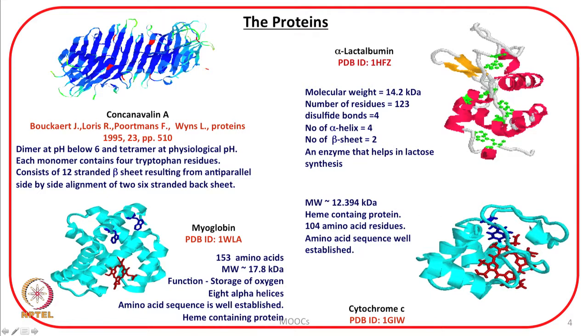And earlier I also took the example of cytochrome C, that is, if we reduce the pH to about 1.5 or 1.8 and then introduce some large anions, this protein can also be pushed into molten globule states. And there are other examples also with these two and a few more proteins. Now, let us discuss isothermal titration calorimetry in identifying the molten globule state.